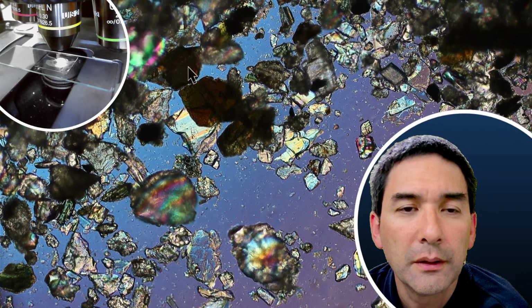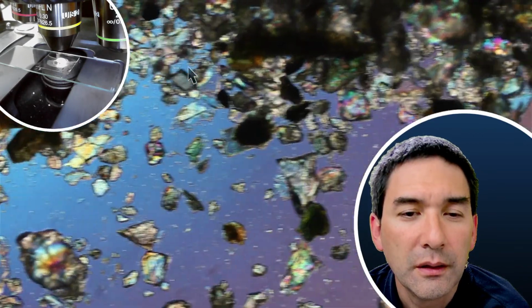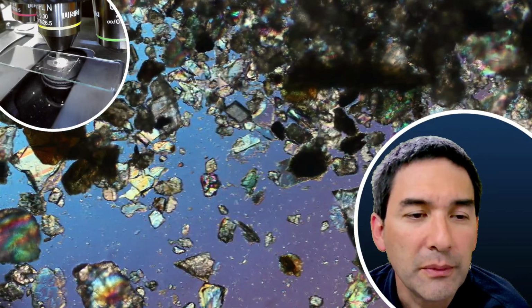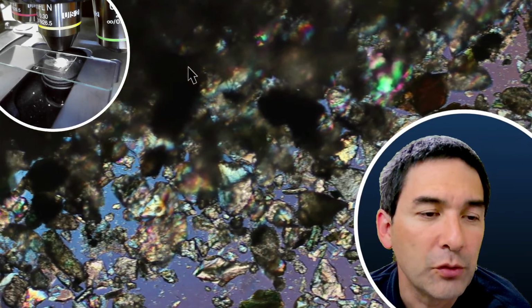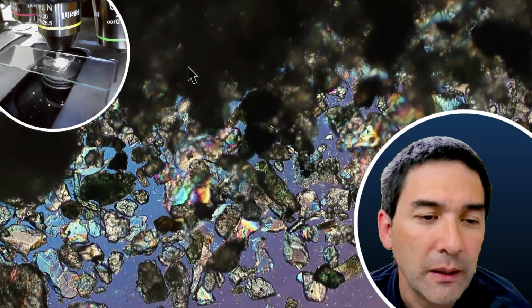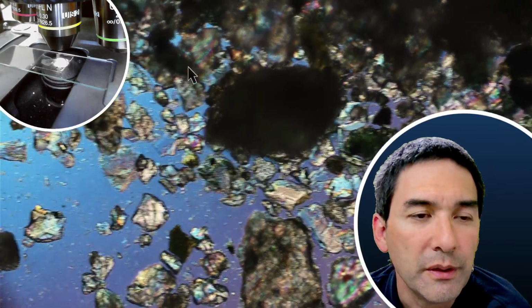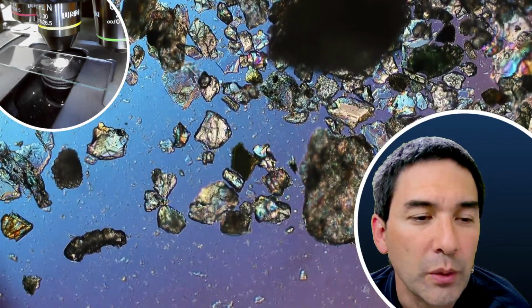But I have also seen, this would be a typical case where one would make a time-lapse video, because sometimes you are able to see the sand grains move around if other microorganisms start to bump into them. Sometimes they're even attached. I've made some videos some time ago where there were some diatoms moving, and they were moving the much larger sand grains as well.